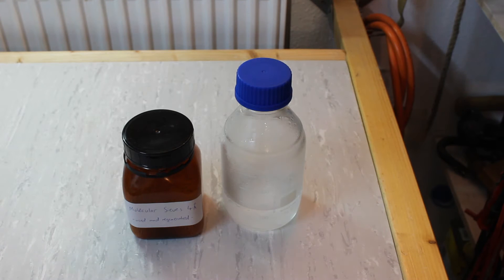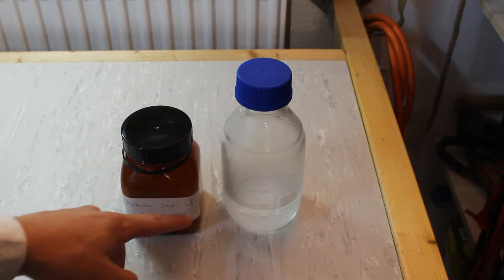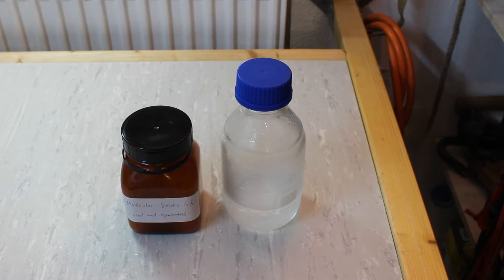There are a couple of ways to dry diethyl ether, but in my opinion the best and most convenient method is using molecular sieves. I have some molecular sieves 4A here — the 4A refers to the pore size, and this is the correct one to dry diethyl ether. Since the ether molecule is bigger than the pore and the water molecule is smaller than the pore, only the water is being absorbed.